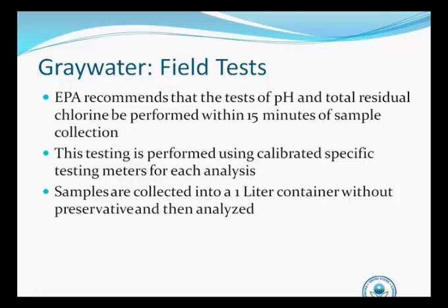And then these two samples are unpreserved, so generally these are collected in a 1 liter container without preservative and then analyzed right away. And these meters are generally available online. There are several manufacturers that produce these, and you can get decent meters for not very much money. But once again, there's plenty online where you can reference these methods and take a look.